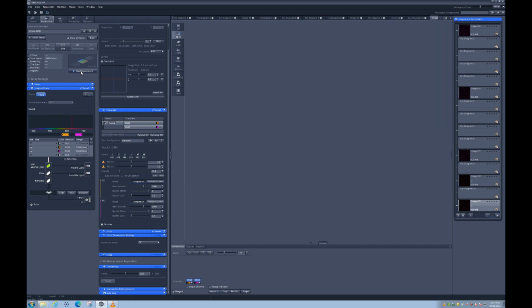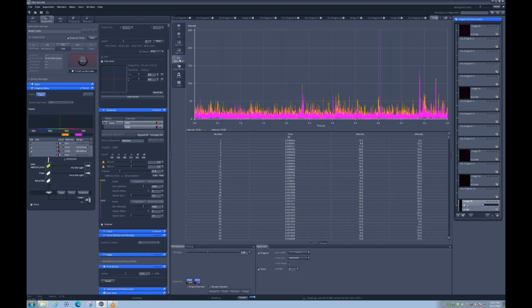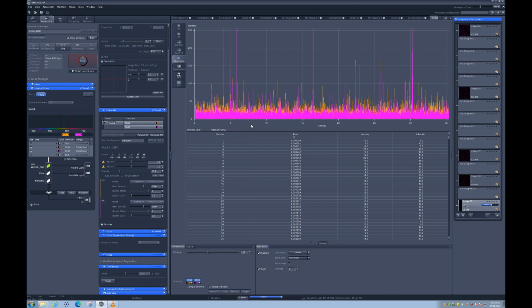So what do you see here? You have to move to the spot scan. Yeah, nice fluctuations. So some dots are, well, they are oversaturated, so maybe we should decrease a little bit the laser power, but generally speaking, everything is fine. So you have nice fluctuations with nice spikes that can be now analyzed with our program. And now we wait a little bit until it's done. So it's going to be roughly 1 minute, and 1 million points are going to be recorded.